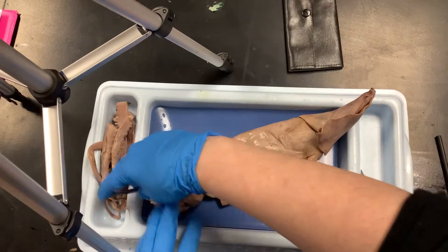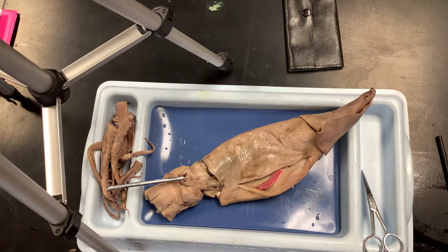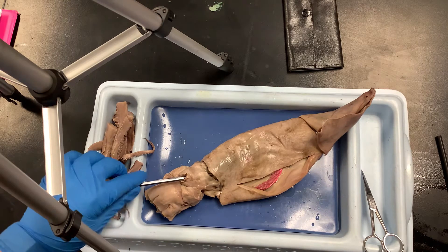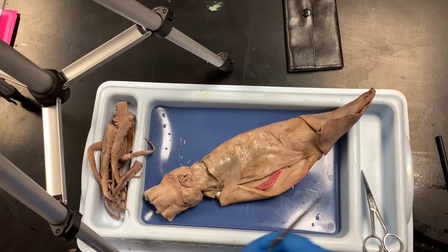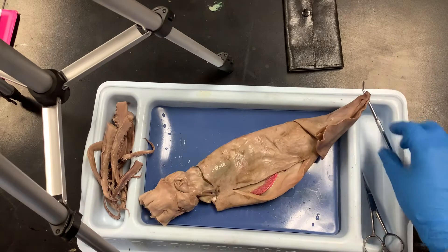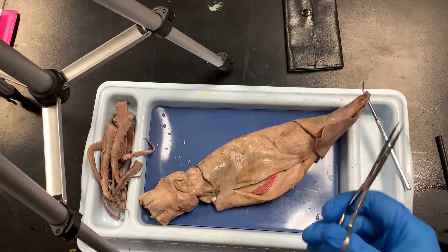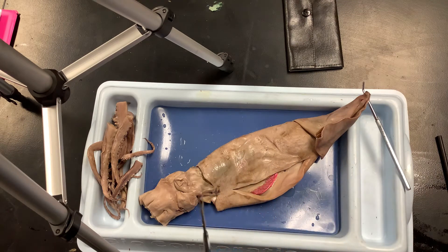You should be able to stick your probe into the siphon and it'll go up into the body — it's open, there's a hole. Make sure everybody has found the siphon before we move on.